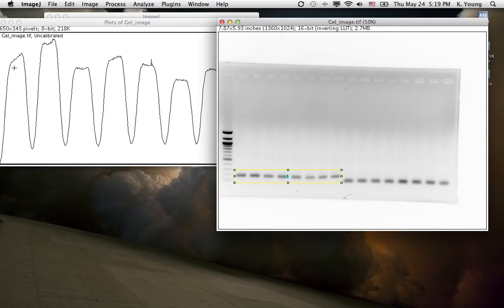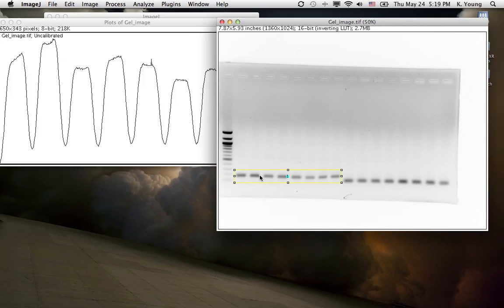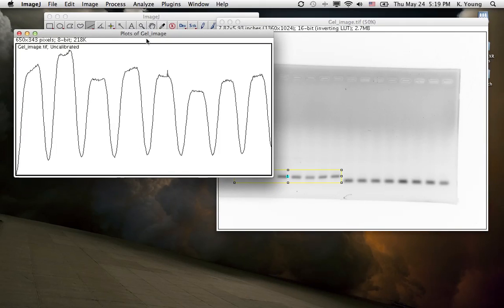So this first peak represents this band here. And this peak represents this band here. So if you look at it, the intensity of this band here, number 2, is more intense than band 1 here. And that's indicative according to this plot of the gel image right here.